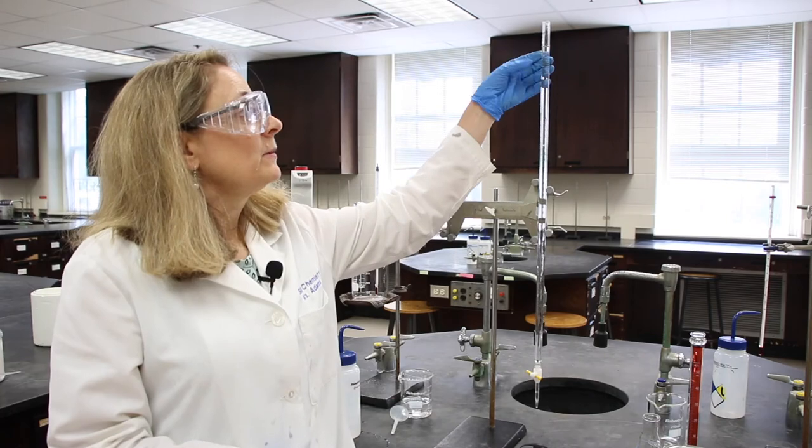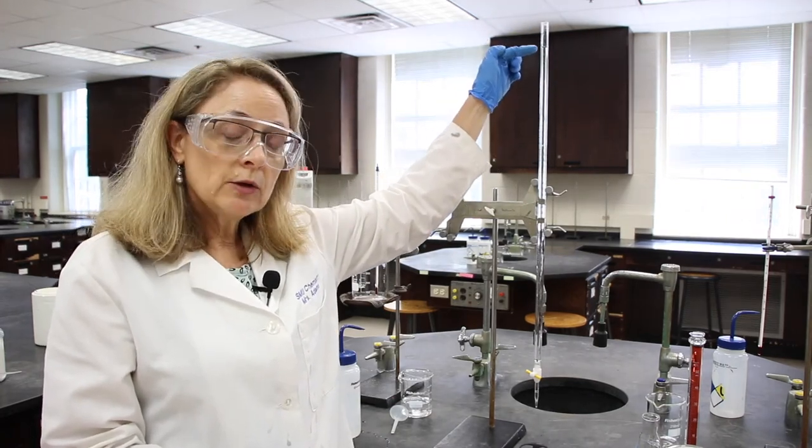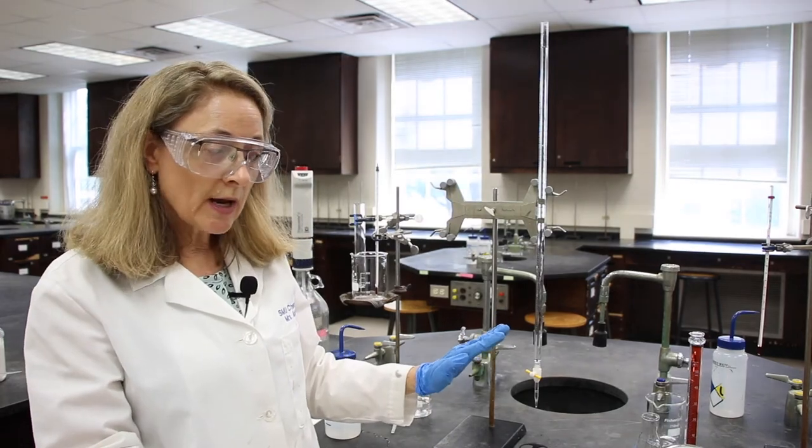Another thing, this is a 50 milliliter burette, but we are just going to read the value here. We're not going to do any subtracting from 50.